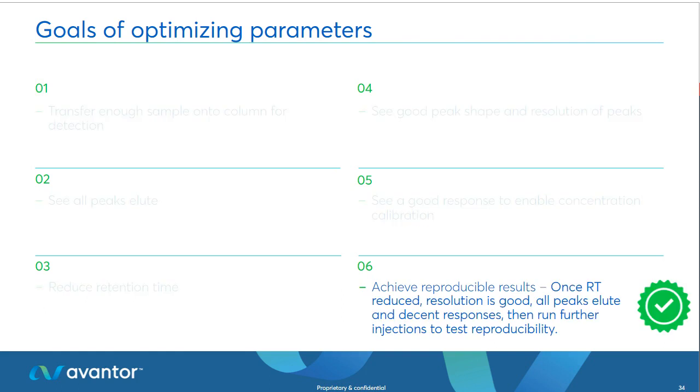And then once we've achieved all of these points, once the retention time is reduced, resolution is good, all the peaks are there, and we've got decent responses, then we can run further injections to test reproducibility.